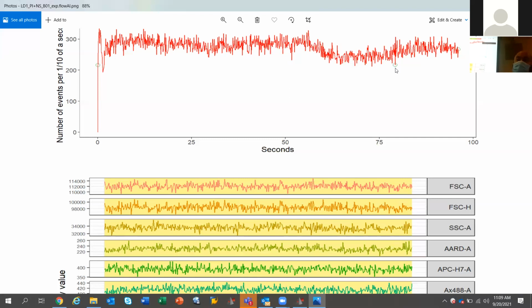Because what happens is that you're running multiple cells simultaneously. They're going through the acquisition. And when it's running too fast, you might have two cells, and then the signal that is detecting your emissions is getting partially one, partially the other. So you're not getting accurate data. Okay, so don't run it on fast.